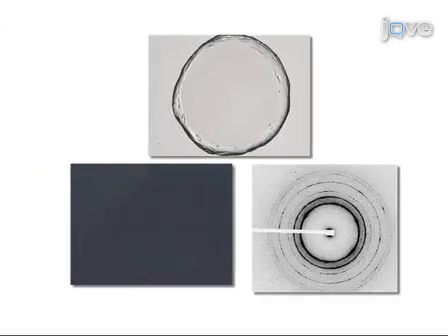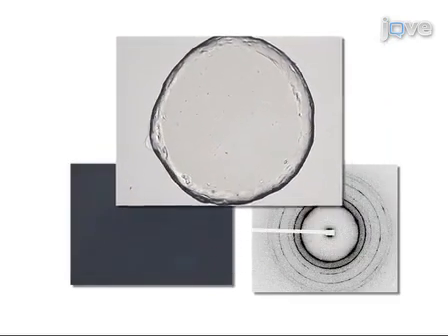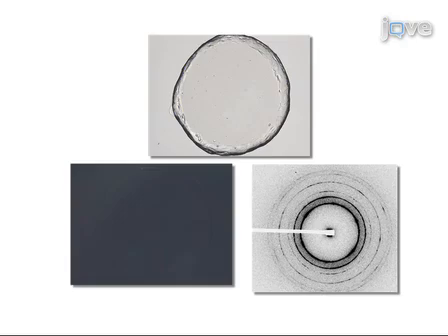Formation of LCP can be verified by its transparent and gel-like consistency, and by the absence of birefringence when viewed under a microscope equipped with cross-polarizers, or, if possible, by using small-angle X-ray diffraction.